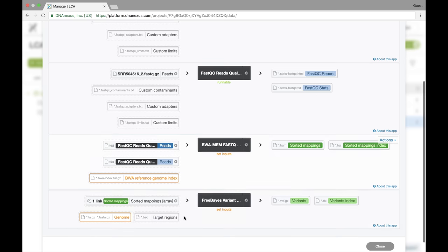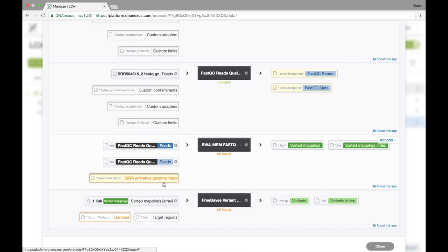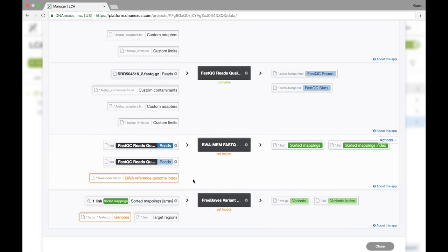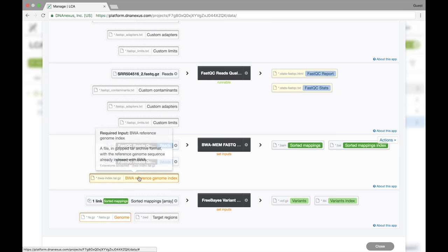That's because all our required orange parameters have not been filled. So we're missing the BWA reference genome index and the genome for Freebase variant caller. So now we'll set our BWA reference genome index.